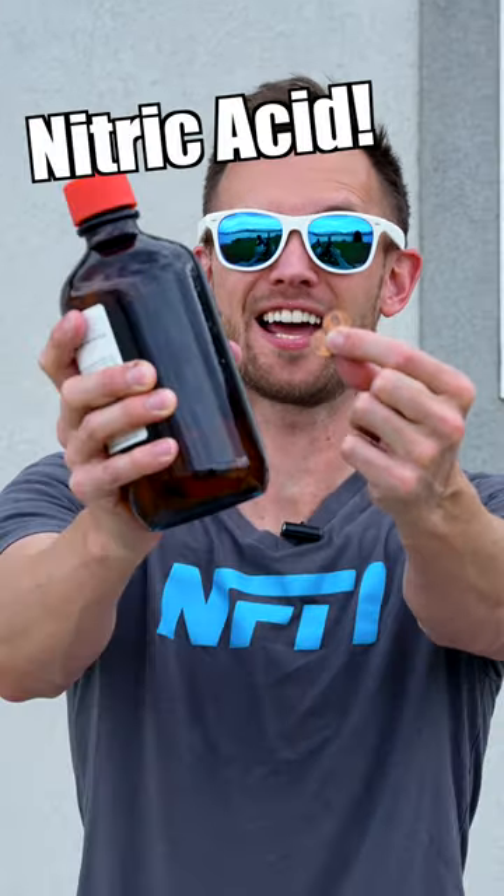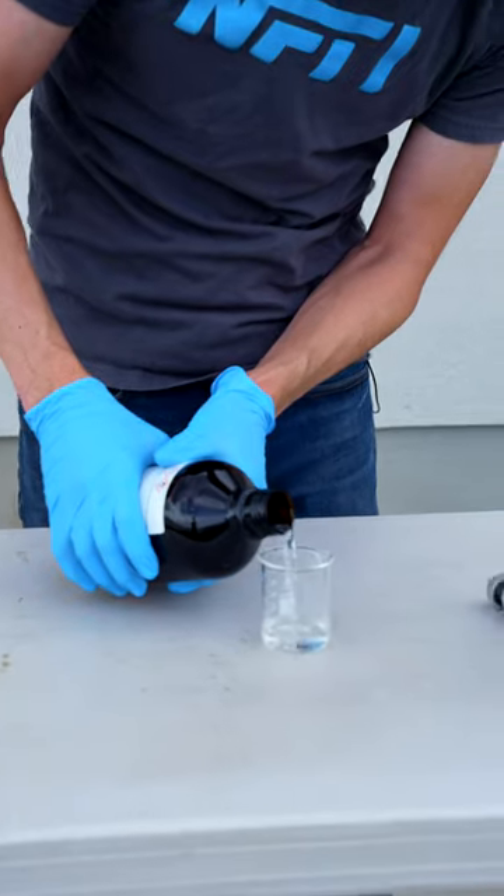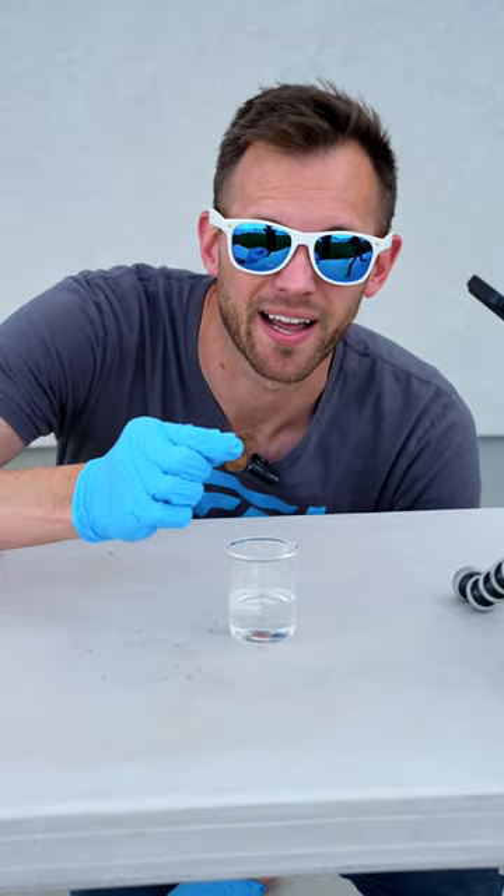Watch what happens to these pennies when I put them in nitric acid. I'll drop these in and then I'm gonna back away.